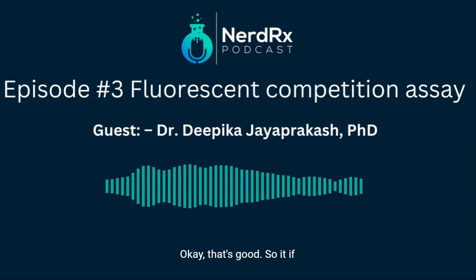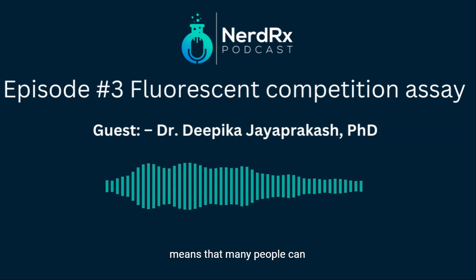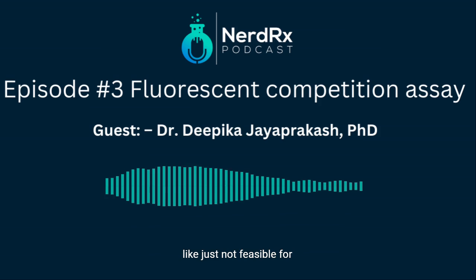Okay, that's good. So if the cost is not so much, it means that many people can develop this technique and use it routinely in their labs. Yes. Because there are certain techniques we covered in the previous episodes that are just not feasible for everyone to do in their lab, like high throughput screening and cryo electron microscopy.